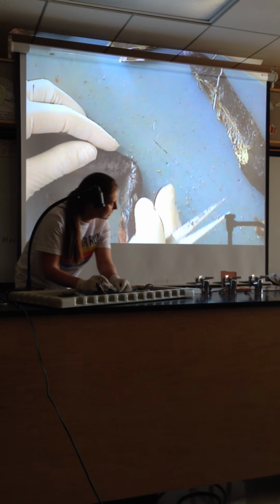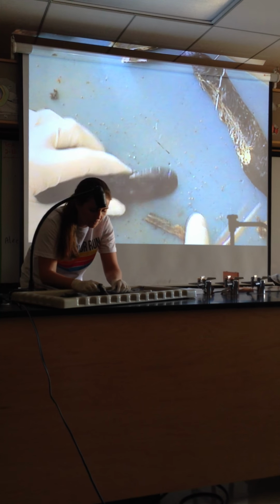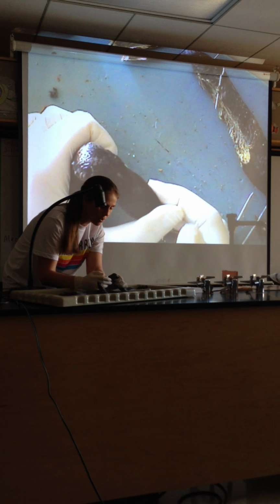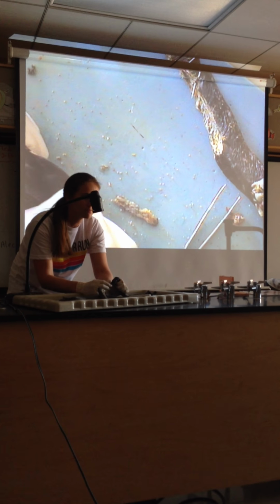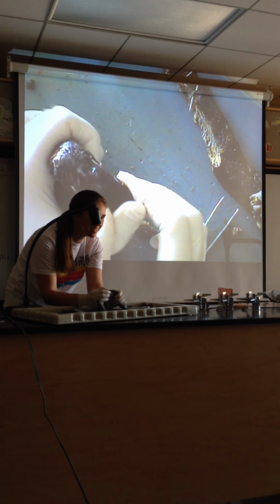All right. The next portion is the medial nostril. The medial nostril is located between the eyes. So if you... Can I borrow somebody's probe, please? That means one of you is going to have to stop for just a quick second.